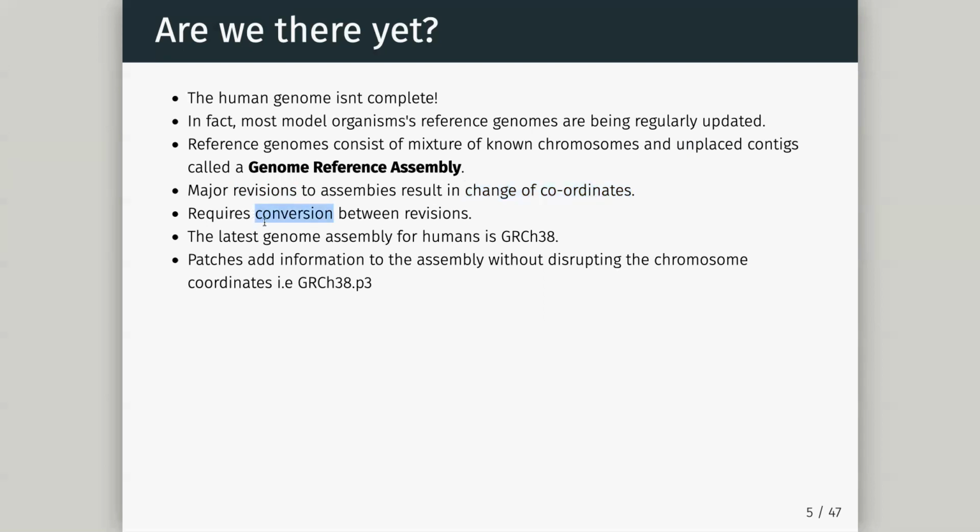You need some type of conversion between these revisions, either using this liftover tool or, most often, and I recommend this, you just realign your data to the new version. I think the new version of the human genome is still GRCh38, sorry.